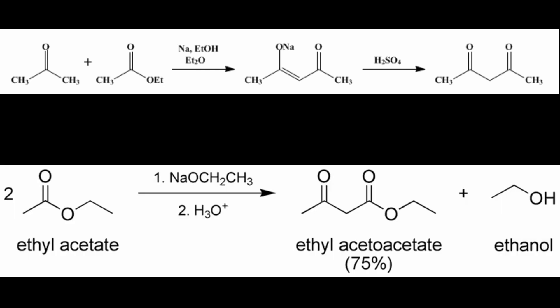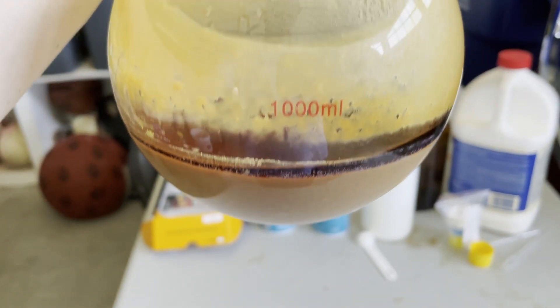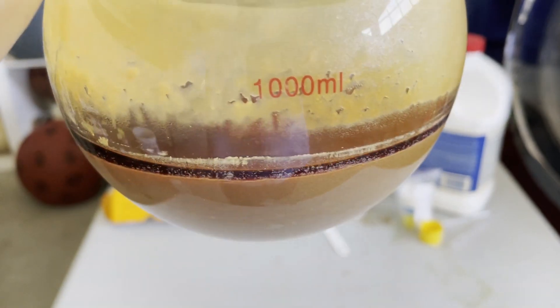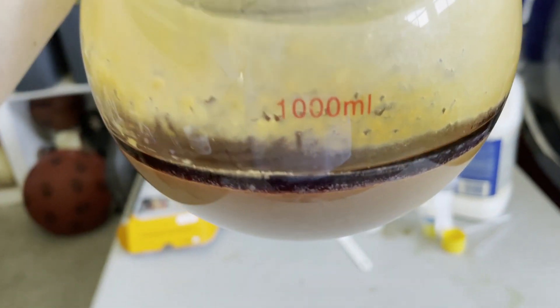The reason why I had to add the acetone right away is because if I didn't, the ethyl acetate would have gone through its own ester-ester Claisen condensation. Going back to the physical reaction, it has now been cooled down overnight for about 12 hours. Now I can separate the solid from the liquid, because our goal is to have the solid, since that is our sodium acetylacetonate. For this, I'm just going to filter using a Buchner funnel.